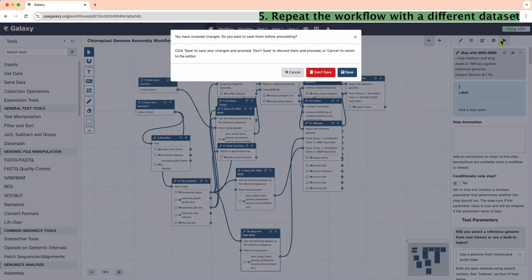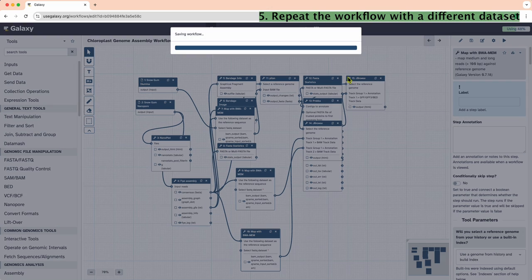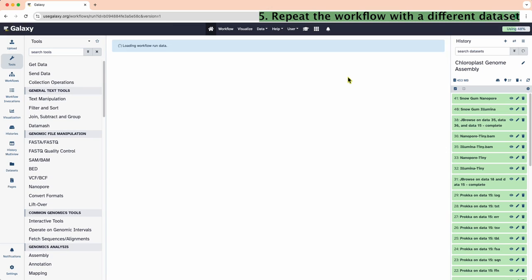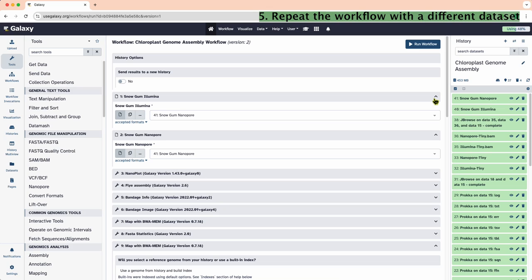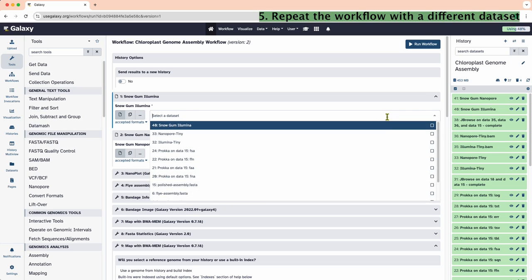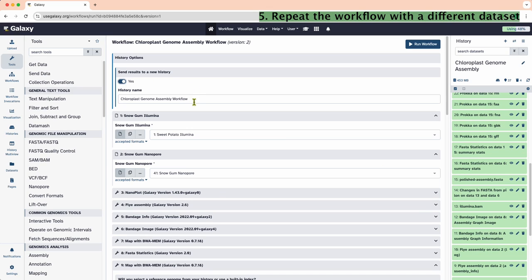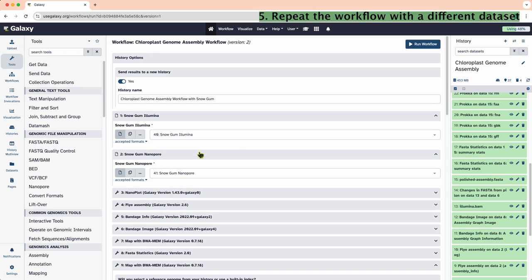Beautiful, isn't it? We can further edit the workflow by moving the nodes around. We are almost ready to run the workflow. Make sure to adjust any settings specific to this dataset. Are our inputs correct? What should our genome size be for the Flye assembly step? We want to send all new outputs to a new history. Hit Run.